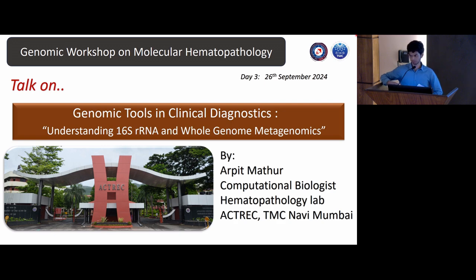So what it essentially does, it's not just bedtools. You can use anything: bedtools, you can use SAMtools, you can use any pileup file, you can use GATK's DepthOfCoverage. Essentially, it will tell you for this region how many times it has been read. That's all that it is telling you. It is telling you to look at a segment of the genome and find out how many times it has been covered. That's about it.